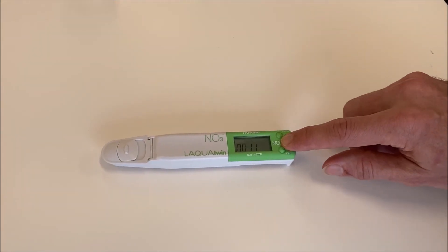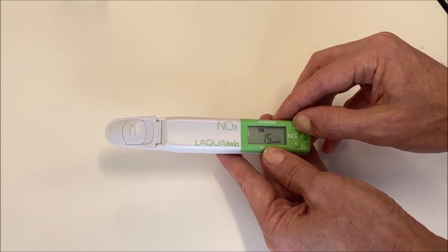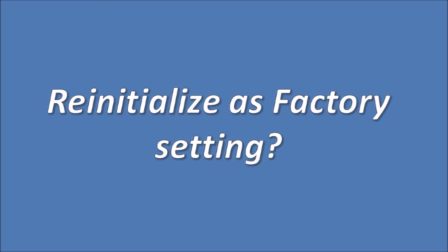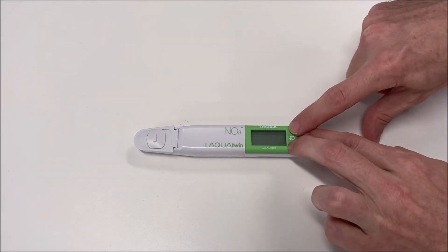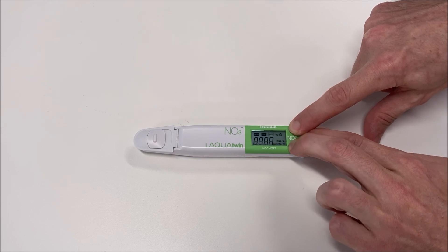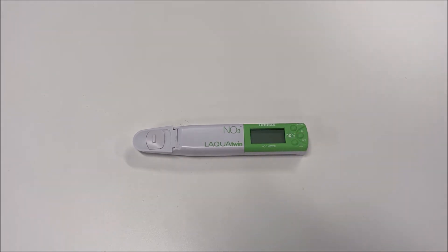Switch the meter back on and press calibration to display the two values just set. Switch back to factory settings by switching off the meter and holding all three buttons until INIT is displayed. Then press calibration to switch off the meter. Switching the meter to factory settings restores the preset calibration values at 150 and 2000 ppm.